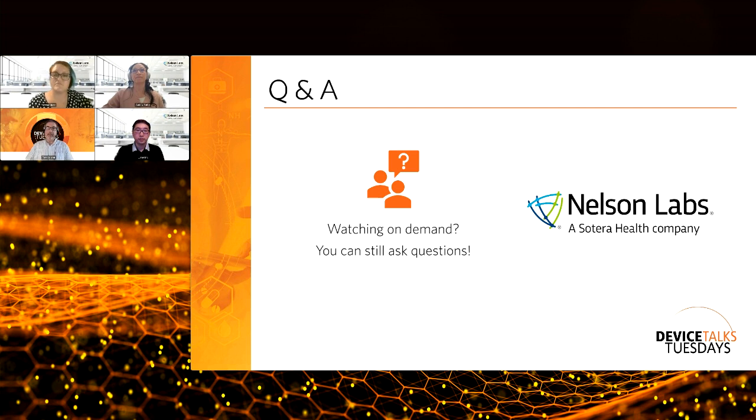Go ahead, sorry. We'll go one more thing, an extra minute for you. Go ahead, Katie. If there are multiple components and materials that are very large, make sure that the ratio of surface area between the final finished product and what you're testing is the same. That's another part to include.